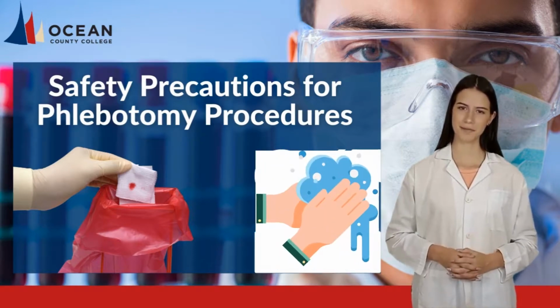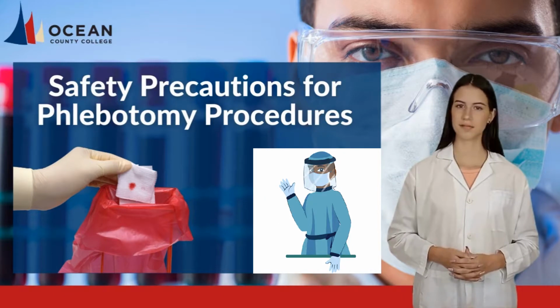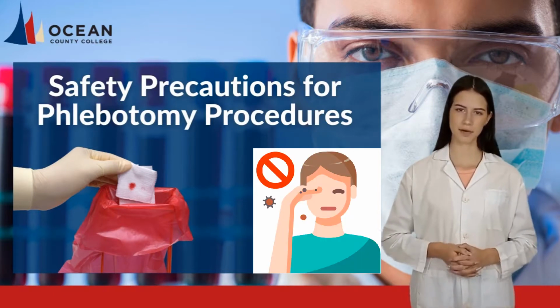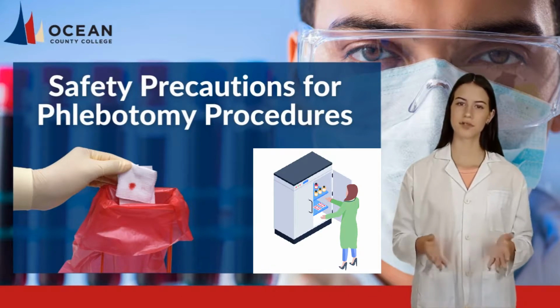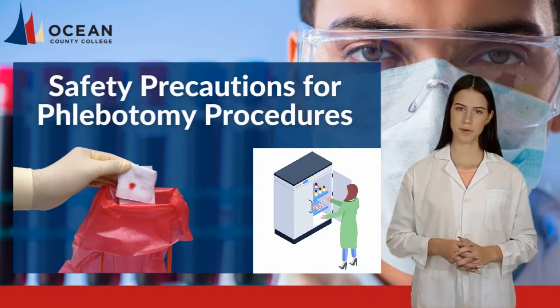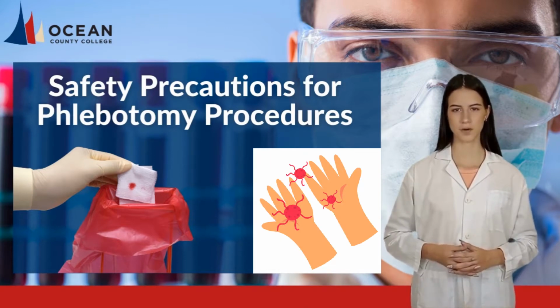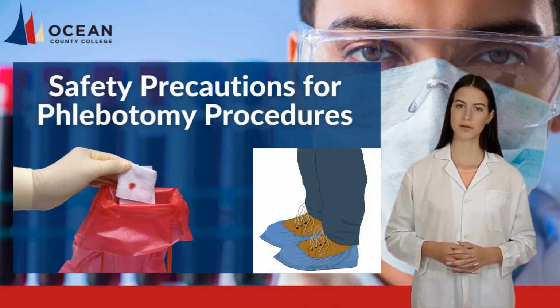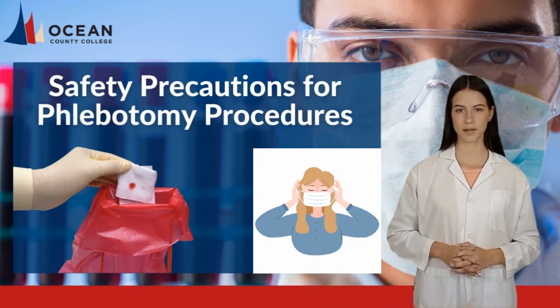Practice hand hygiene. Always wear the appropriate personal protective equipment when handling specimens. Avoid touching your face, nose, or mouth in the work area. Never store food or beverages in the laboratory refrigerator with reagents or specimens. Do not let anything hang loose that might get contaminated or caught in equipment. Protect your feet from spills, slips, and falling objects. Avoid putting anything in your mouth in the work area.